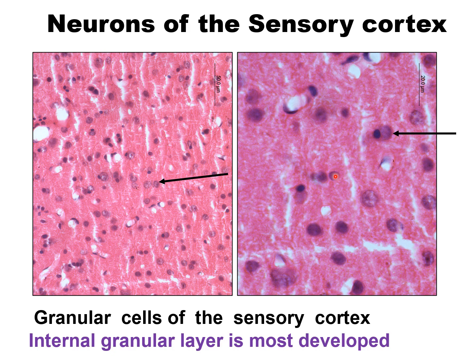So, identifying features of neurons are the nucleus and the cytoplasm containing the Nissl granules. In all other places, we have seen the neuronal cytoplasm containing Nissl granules. So these are the neurons, these are the sensory neurons. This is a section of the sensory cortex, and the outer and inner granular layer of the visual cortex, auditory cortex or the general sensory cortex contains this type of neurons, the glial cells, and these empty spaces are the blood vessels.